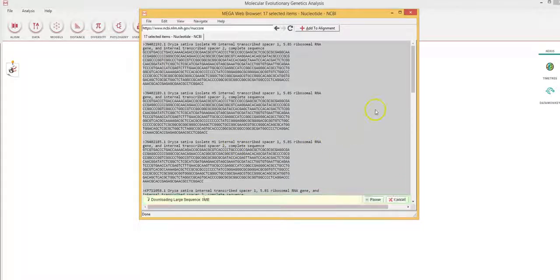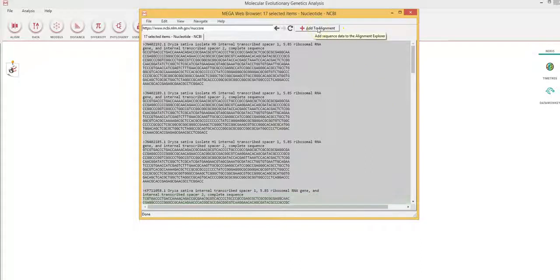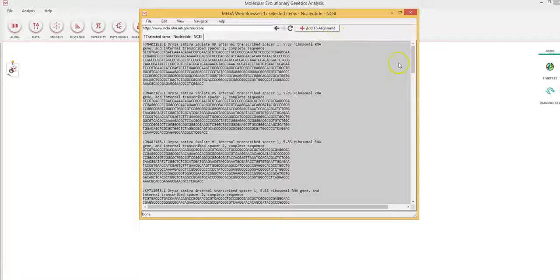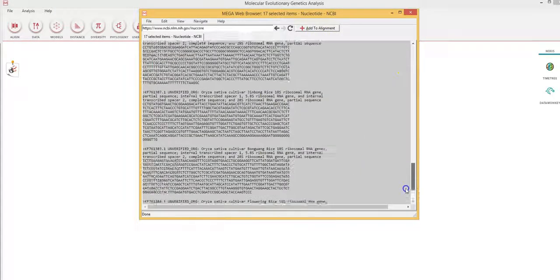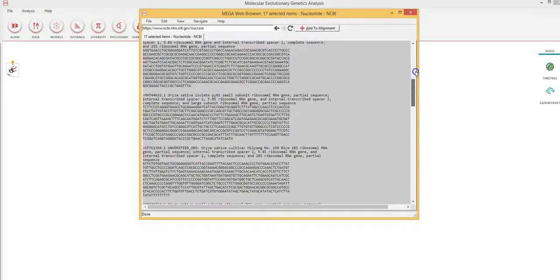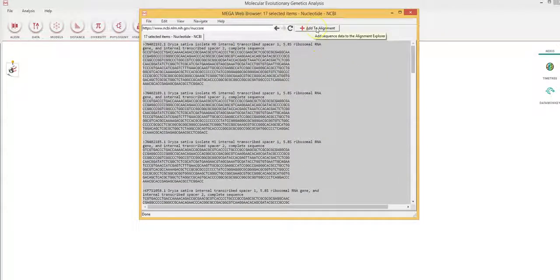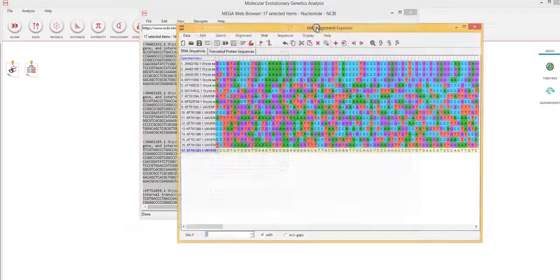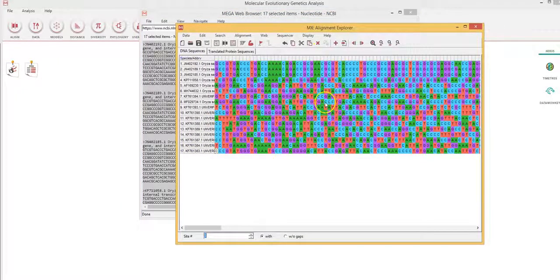So you have all the sequences and then you click on this icon here, which is add to alignment when everything has been imported. So now the green bar has all the sequences depicted. So I add to alignment, click on add to alignment. And now you can see all the sequences aligned together.